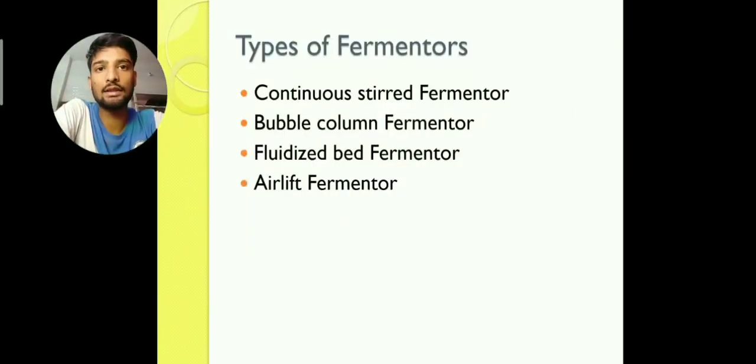Now we will discuss types of fermenters. There are multiple types of fermenters being used, but I have taken the example of a few fermenters, and they are continuous stirred fermenter, bubble column fermenter, fluidized bed fermenter, and the last one is airlift fermenter.